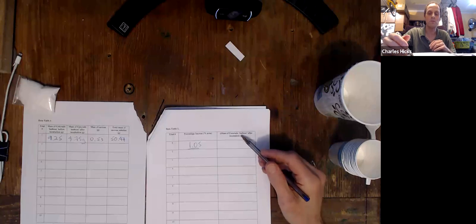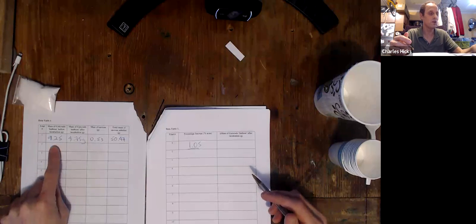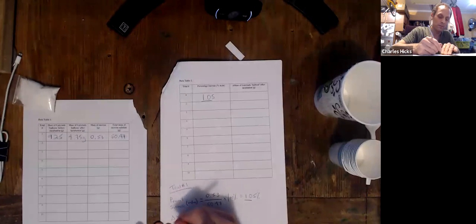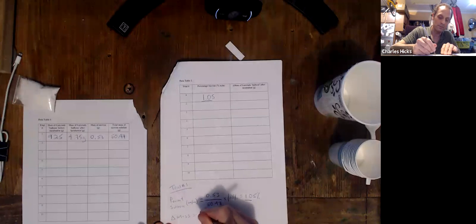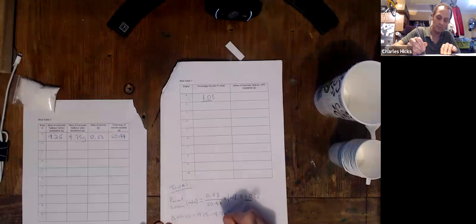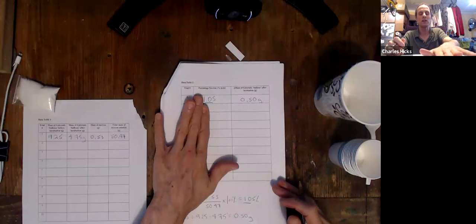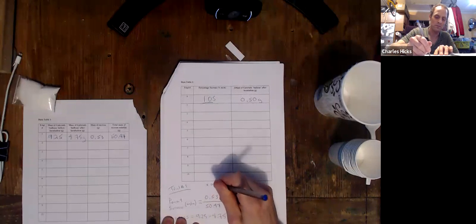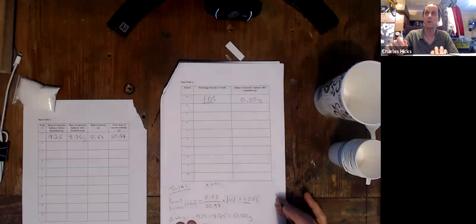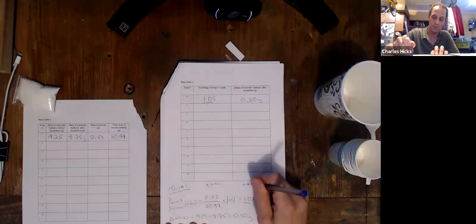The next step is to calculate the change in mass for each one of the balloons. So for my sample data here, the change in mass is the difference. This is 9.25 minus the 8.75. After you have all this data filled in, you're going to make a graph with the percentage of sucrose as the x-axis and the change in the mass of the Gatorade balloons as the y-axis. The changes in mass for the Gatorade balloons may be either positive or negative. You may see some of them gain mass. You may see some of them lose mass.